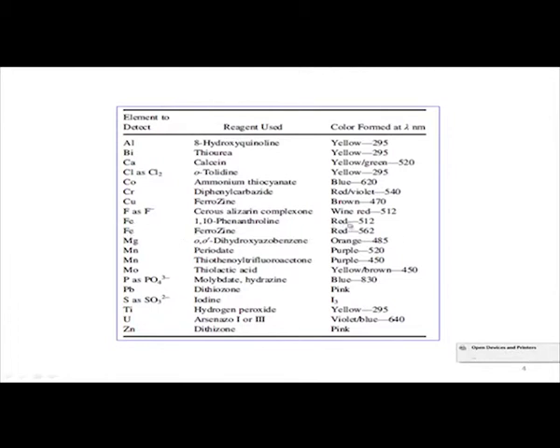So, when this solution is red colored, what is the color which is formed, and we should also label it with the corresponding lambda max. The solution is red, but it is absorbing in the green and yellow green range, which is 512 to 562 nanometer, and which will be useful like your thiocyanate for the determination of the iron in the solution.